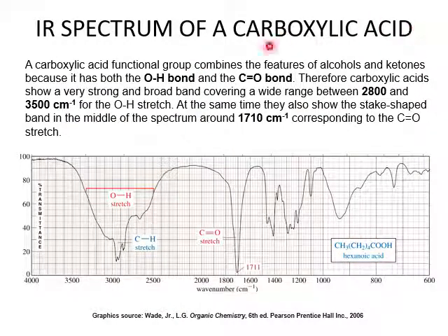For carboxylic acid, you're combining the OH bond and the CO bond, so you also get a broadening of the OH. So it's like it was a carbonyl, but it's also broad because you're combining both signals.